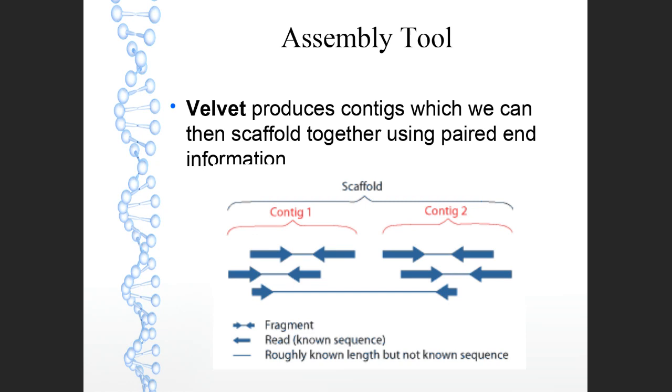In order to make that assessment, we are using a utility script which was designed by a former bioinformatics MSc student, Sujay, who has written a small script to give us some statistics back on how well our assembly has worked. So once we have our assembly, we can also map our original reads back to our assembled contigs and see how it all pieces together.